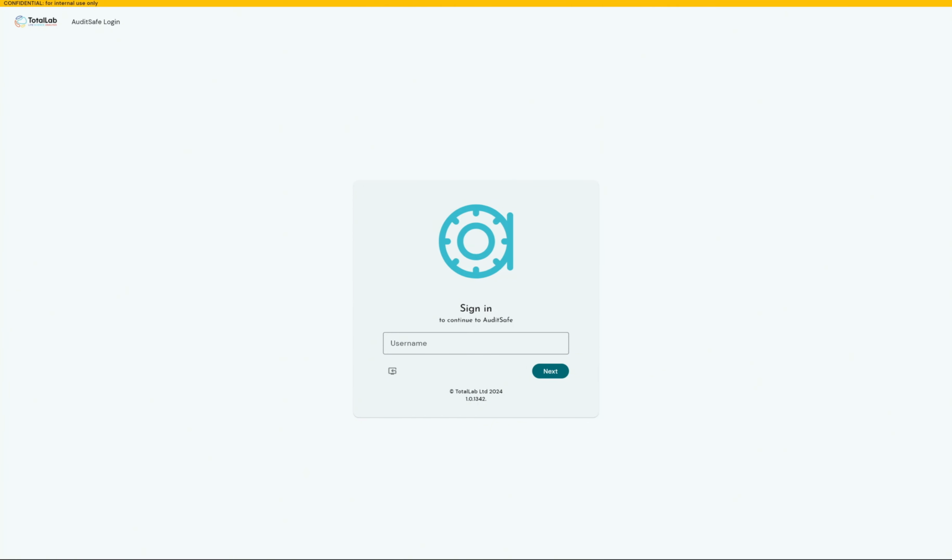So we could, for example, tell you Dave accessed this CSV on this date at this time, and we can see the state that they picked it up in and the state that they left it in, so we can infer changes from there. But we don't have the granularity to say Dave changed cell A3 from A5 to A6. So that is a caveat. However, we do hash the file at different stages, so we can see how things have changed.